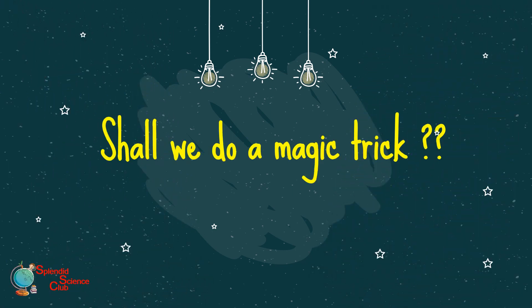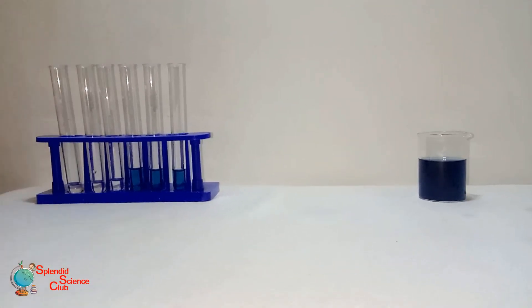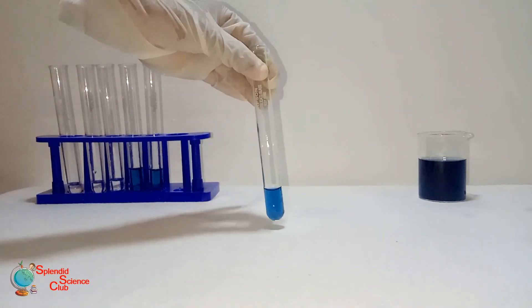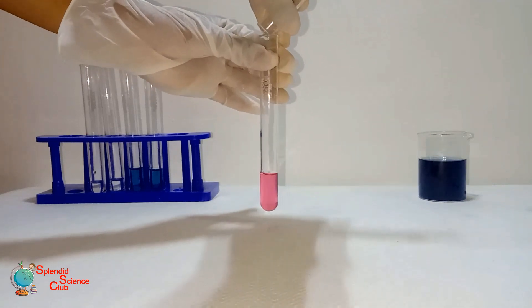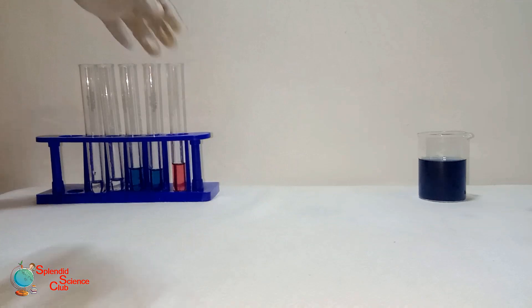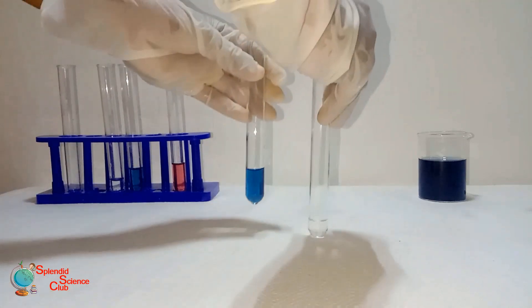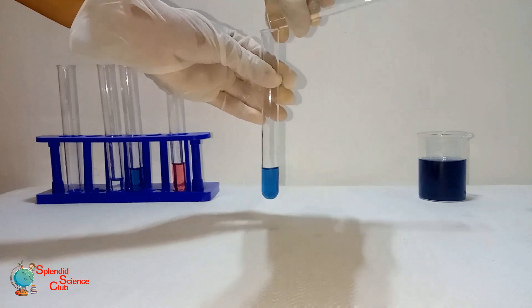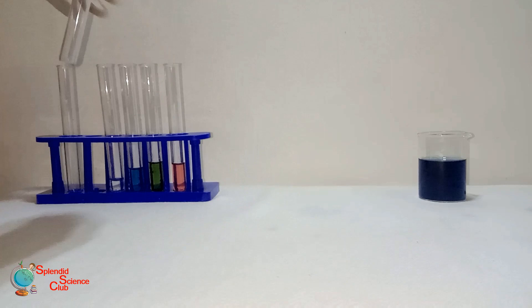I hope all of you will like to surprise your friends — shall we do a little magic trick? Here we go. We are adding a colorless liquid to a blue color solution. Did you see it turned into pinkish red? Then we are adding another colorless liquid to the blue color solution and it turned into green.